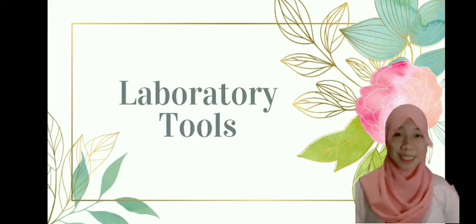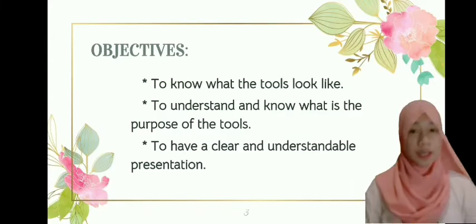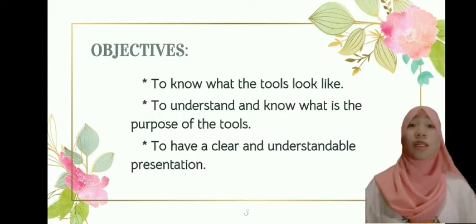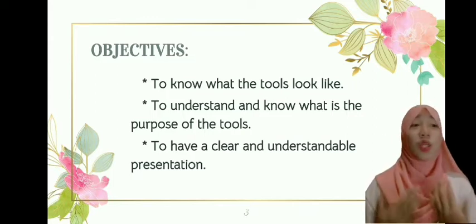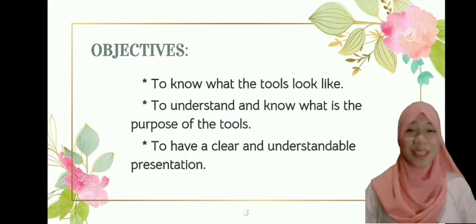So for this presentation, we will tackle the uses of some laboratory tools. Please do listen, guys, and by the end of this video presentation, I hope you learned something from me. For today's presentation, our objectives are, first, to know what the tools look like. The second one, to understand and know what is the purpose of the tools.